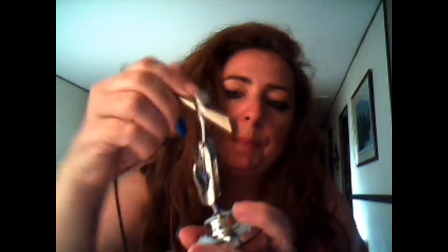Here's the microscope — it has a nice long cord and a brightness knob on this little piece. It comes on an adjustable base; you can bend it down, it bends in all different ways. It has a nice rubber bottom so it's not going to slip, and you can also pull it out if you need to.